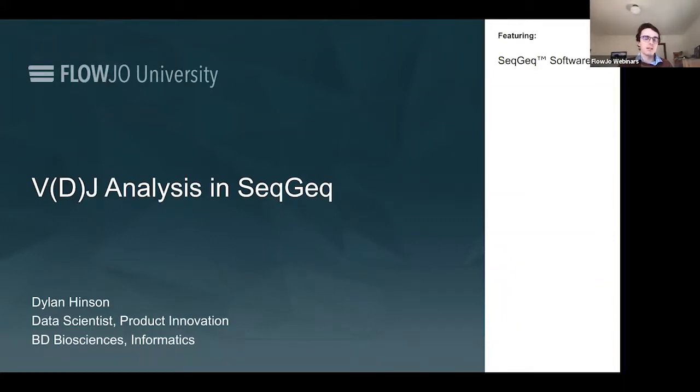We have other webinars that talk about how to use the basic features of SeqGeq, and you can find them recorded on our website under previous webinars, or on our website, Flojo University. There's a SeqGeq page on Flojo University with videos that cover all the basics, and we also have documentation. But for today, for the VDJ analysis, I'll be starting off on a little bit more of an advanced topic, and then looking deeper at this more advanced type of data analysis.